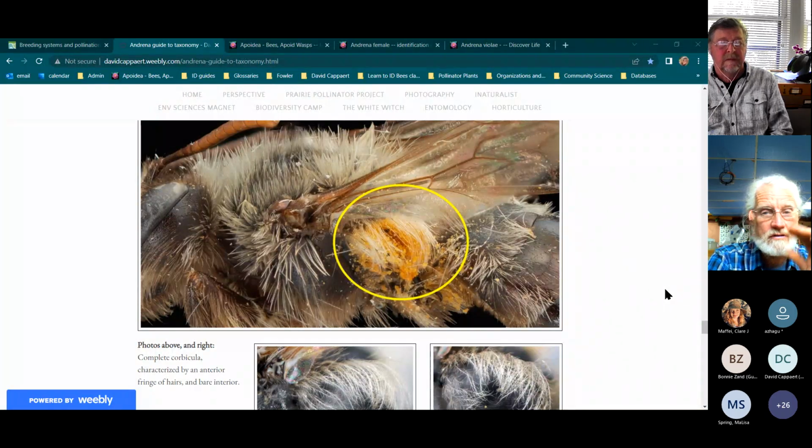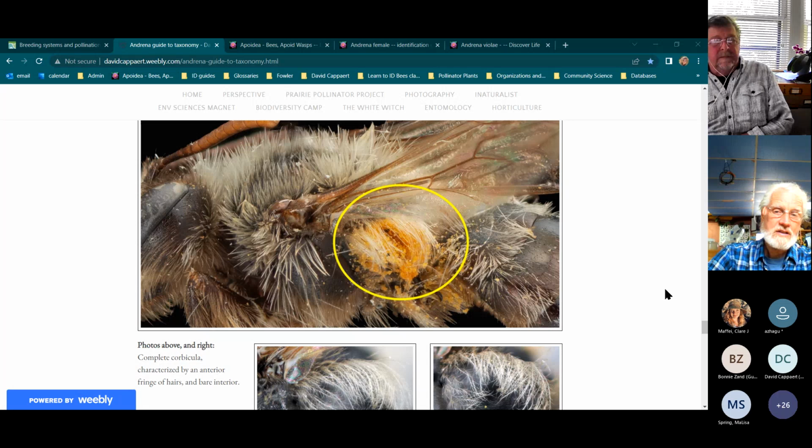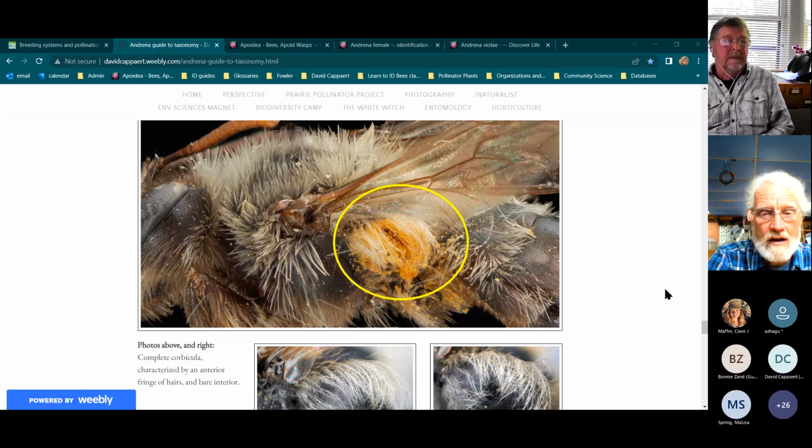In the center of the tibia, you have long hairs. At first glance, they all look simple, but when you dial in there, you see that they're actually 3 or 4 branches and they're pretty long. And that's been several times helpful in dealing with the miserabilis, when I'm like, is it? I'm not sure. So that's my 2 cents.